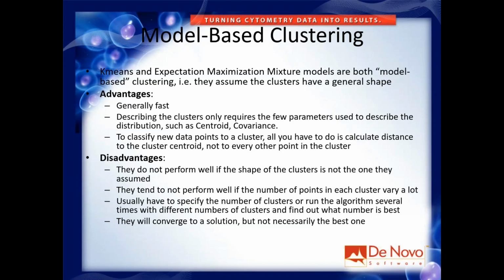And so we'll talk about some ways to auto-determine the clusters. You'll see how basic and simplistic those are, although they sometimes still do work. And again, the key element of this and pretty much every clustering algorithm is they will always converge to a solution.